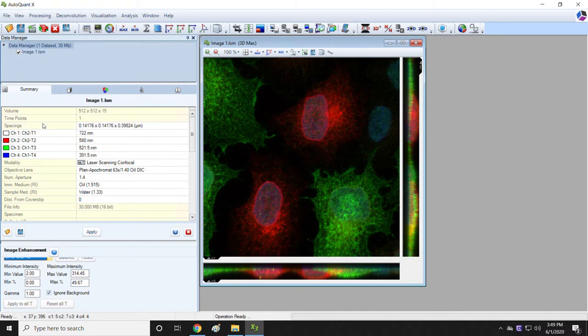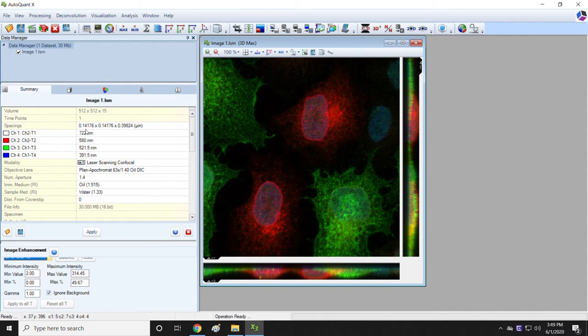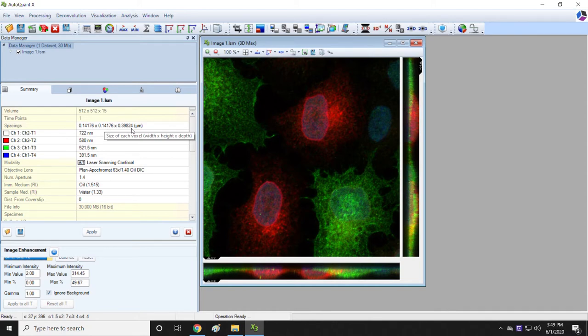The first thing it requires is what the spacings were. The spacings are basically the pixel sizes in X, Y. Those are those two numbers. And in Z, meaning the spacing between the slices in the Z stack. For the Zeiss Confocals, AutoQuant reads those correctly, so you don't need to worry about those.